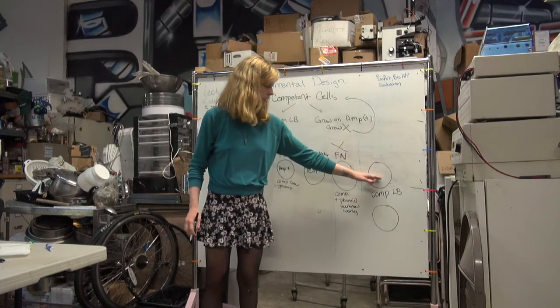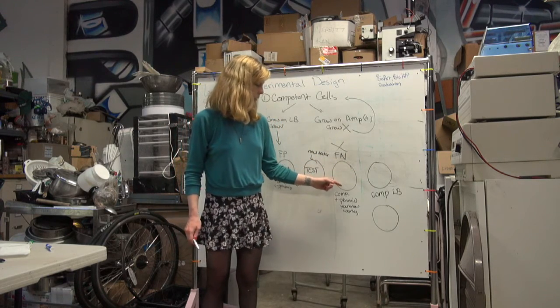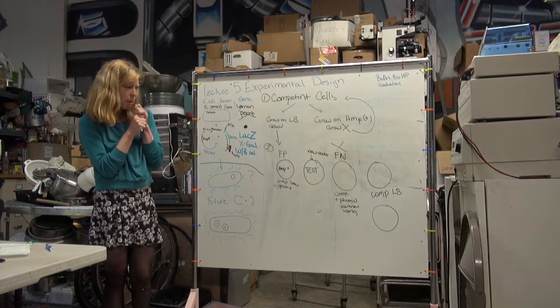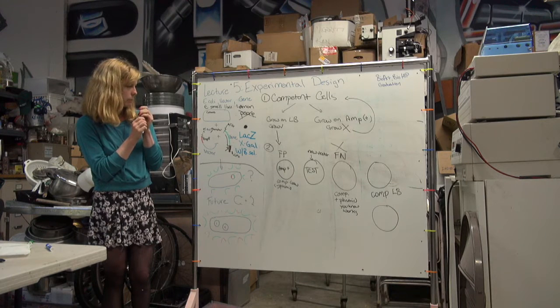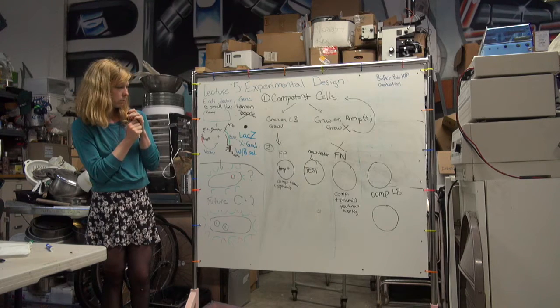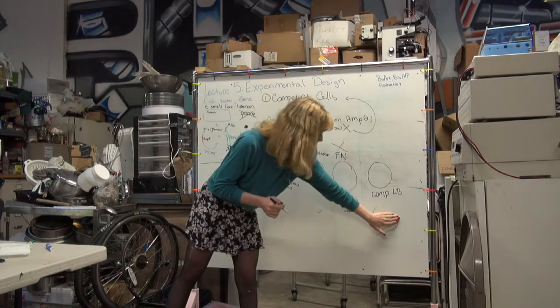This set of competent cells went through the whole process, the set of competent cells that we know worked in the lab, plus a plasmid. There's one thing that we didn't test for. Cells grew. Okay, it might just be 4 plates.